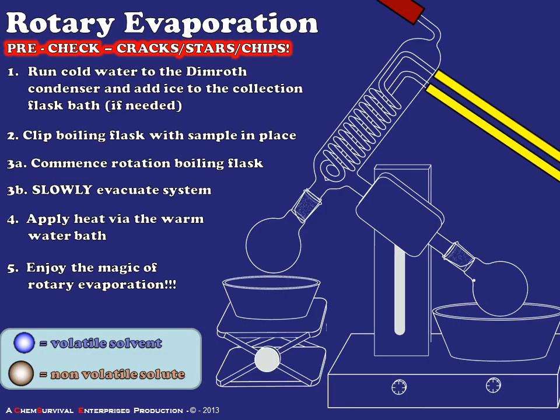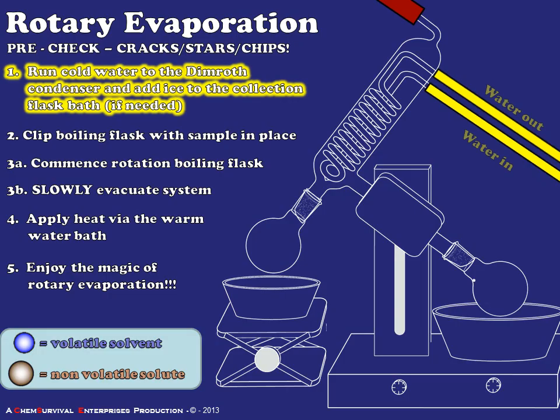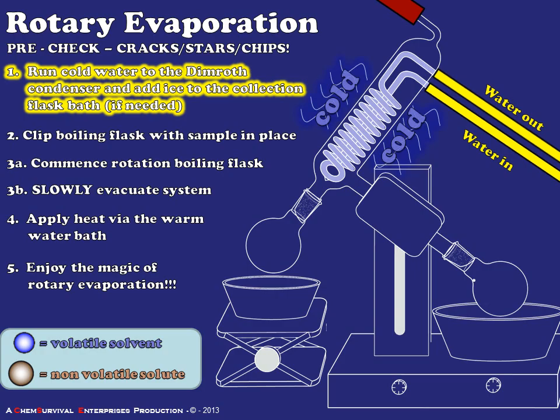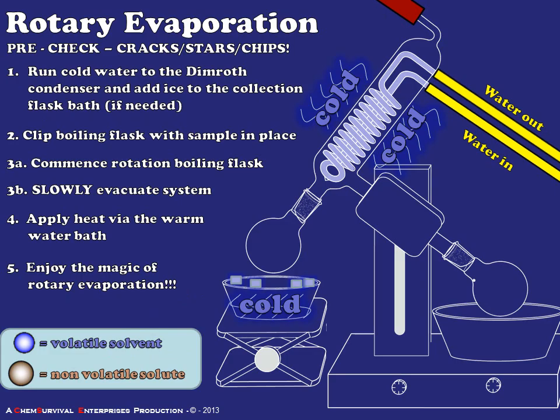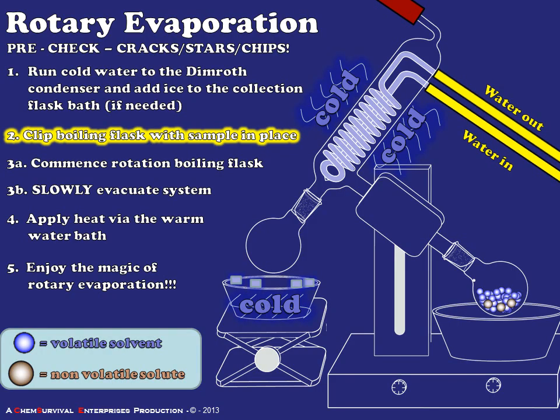If there are any irregularities like cracks, stars, or chips — any defect in the glass which goes beyond just the surface into the matrix — then the rotary evaporator needs to be taken out of service because there's a significant risk of implosion if there is a weak point in any of the glassware being used. Once we've done our pre-check, we run cold water to the Dimroth condenser to create a zone of cooling. We can also add ice to a bath around the solvent trap to accumulate as much solvent as possible in the liquid phase. The next step is to clip the boiling flask in place with your sample in it — the clip should be understood as holding that flask in place so you can let go and begin the rotation.